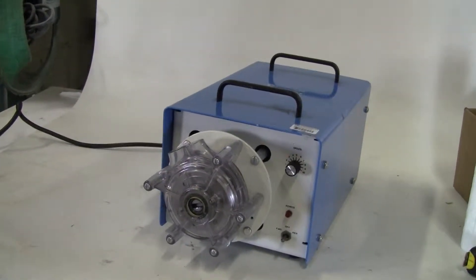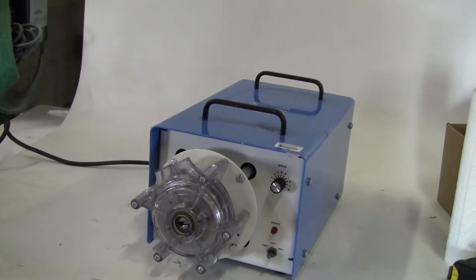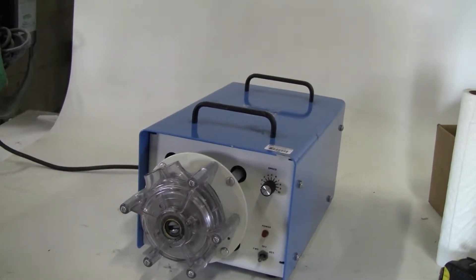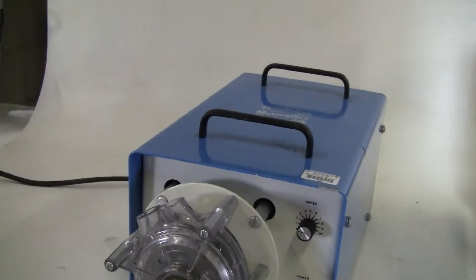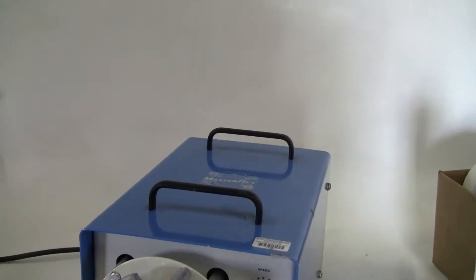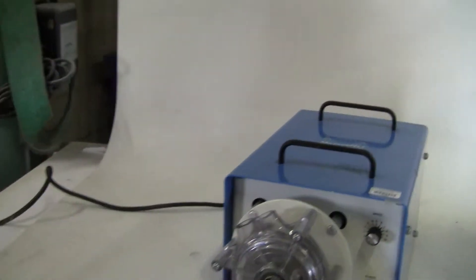Hi, this is Jim from Hi-Tech Trader. We're looking at a Cole Palmer MasterFlex peristaltic pump, model 7549-30. It also has a MasterFlex head 7079-20, 115 volts, 6 amp, 50-60 Hertz.